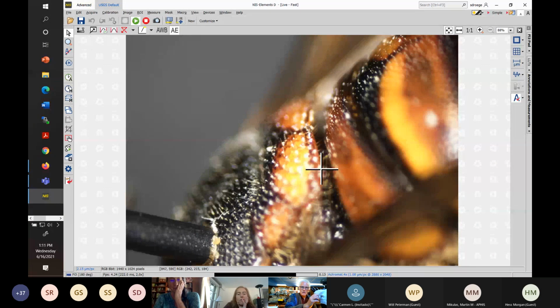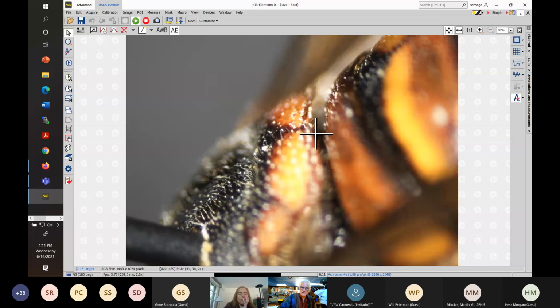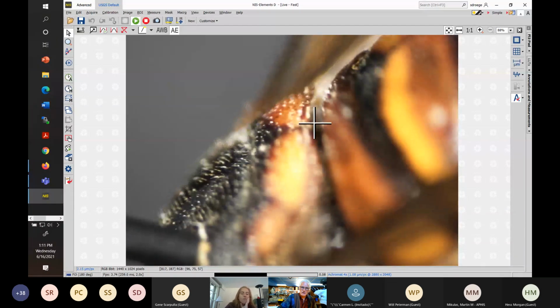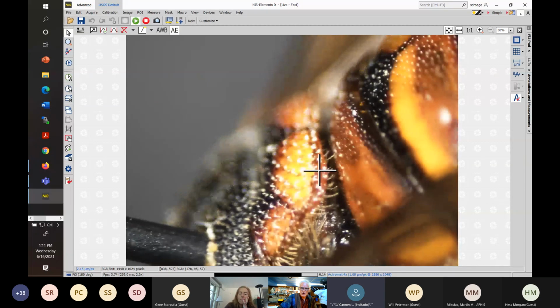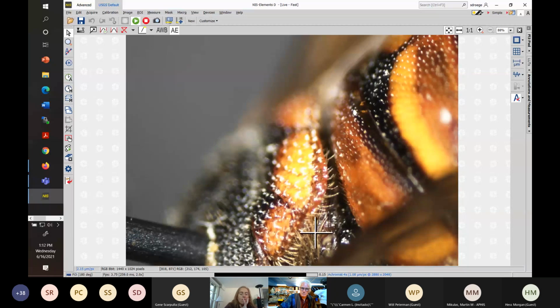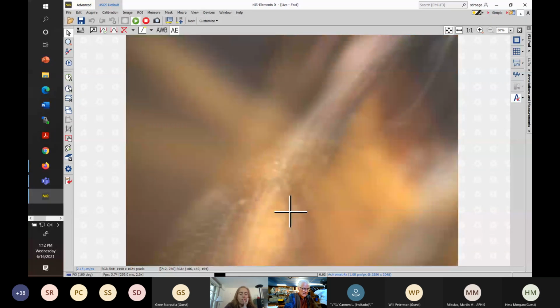All right. So we have a focus thing going on here. Here's this lamellate area of the scutellum. Again, it's a little bit difficult to portray exactly, but you can see that it's thinned out and you can't see the edge of the propodeum there. If we back up, we just note the axilla here. In other groups, there's a point projecting out away from the edge of the body, but not in this case.